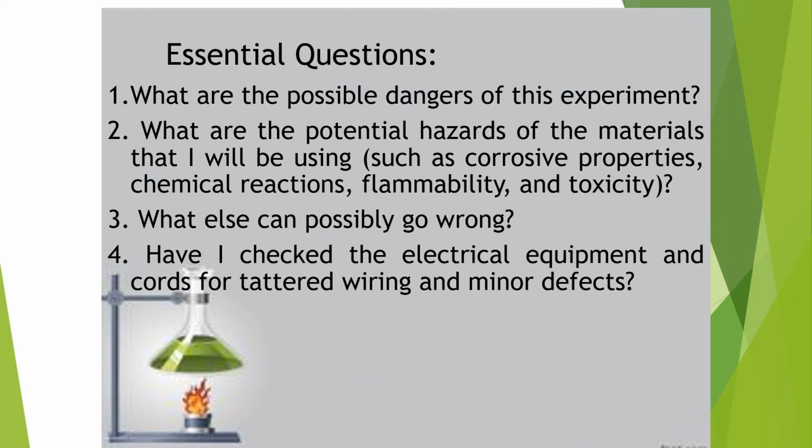Working in the lab, you should ask yourself essential questions. What are the possible dangers of this experiment? What are the potential hazards of the materials that I will be using, such as corrosive properties, chemical reactions, flammability, and toxicity?